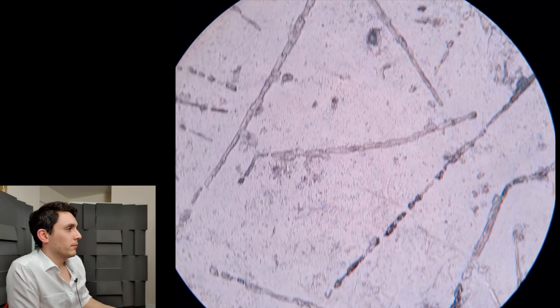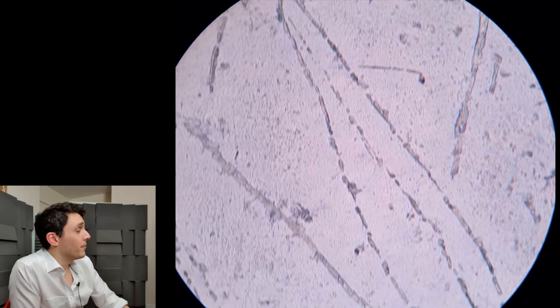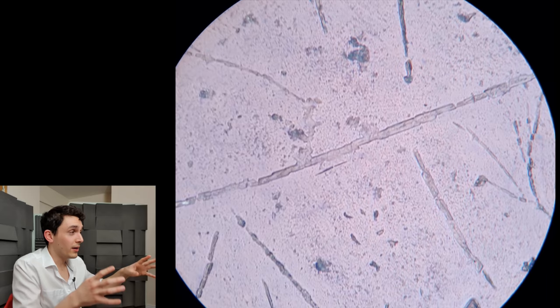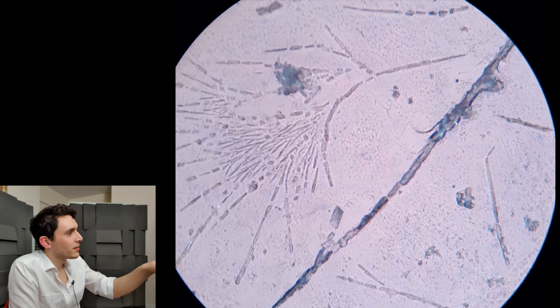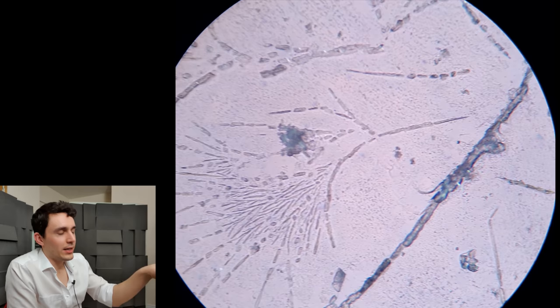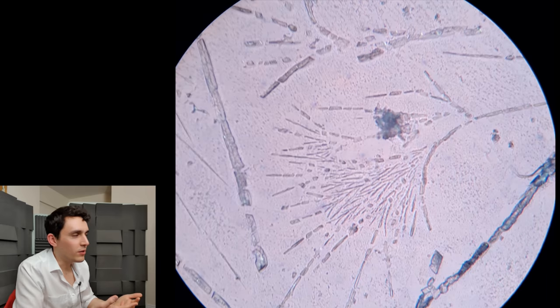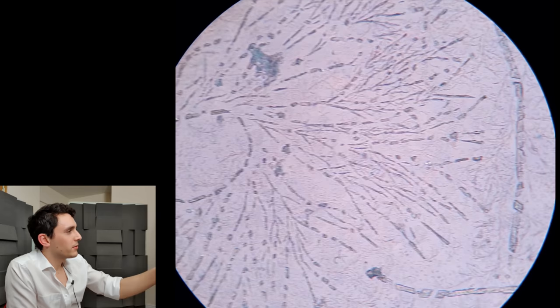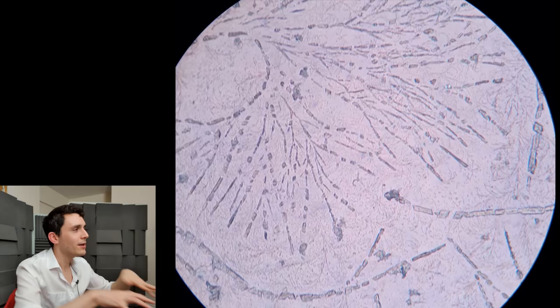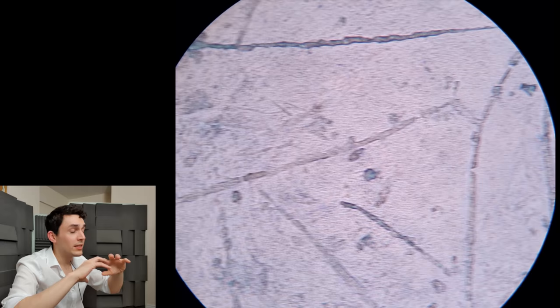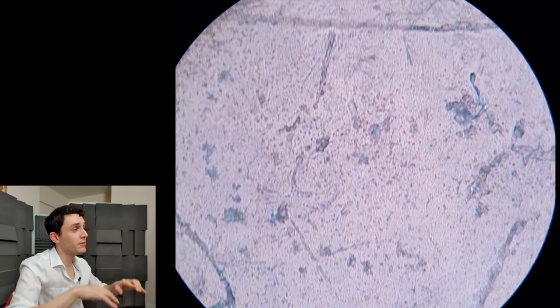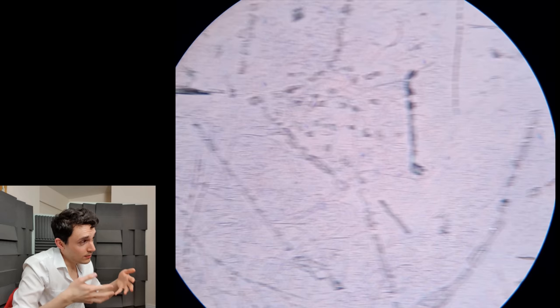As you can see, it's just frigging everywhere. What the potassium hydroxide has done is — look at that — it almost looks nice, really. Just the beauty of this fungus showing up on the microscope slide, it's quite extraordinary. It looks like the crest of Gondor, it's absolutely spectacular. Look at the sheer network of fungus that has now arisen because we've been able to see through the debris. The potassium hydroxide has allowed us to see through and it's exposed what is hiding underneath.